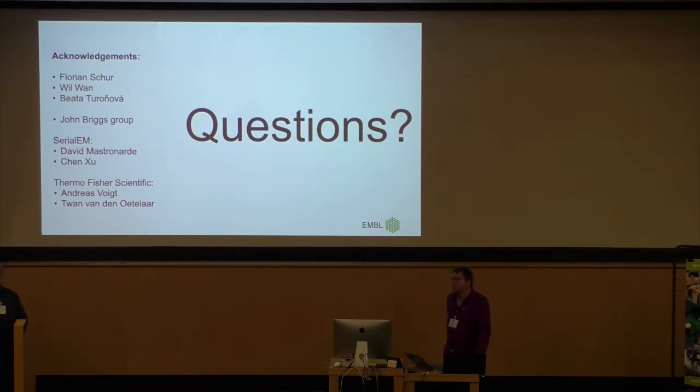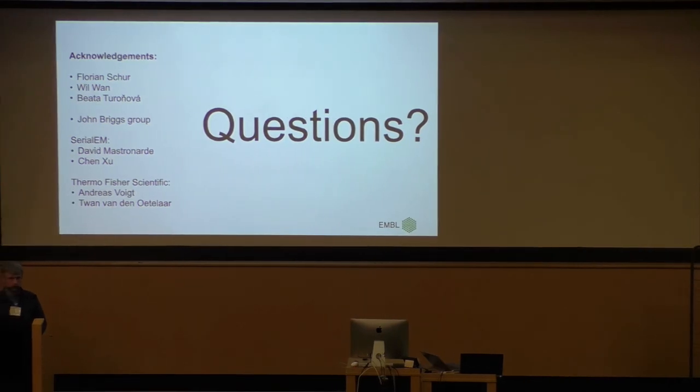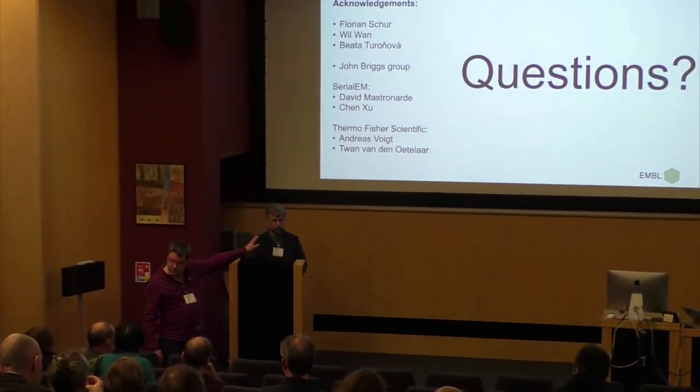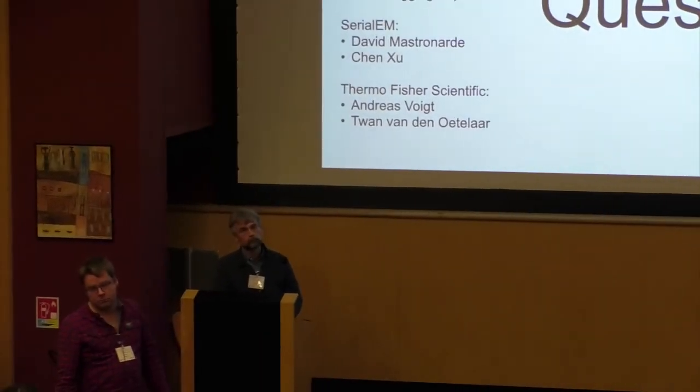Okay, thank you. I still ask you about this small beam. How small can you use for the tomography now? In single particle, our beams are, I'd say, 10% larger than the diagonal of the camera. So it's really just about covering the camera. Depending on location, of course, it's I'd say 400, 500, 600 nanometers. So you don't have this kind of fringe at the top? No, we have had this fringe-free setup for 2-3 years now, but that didn't make the difference. The early results were all without the fringe-free. Then you have to use a slightly bigger beam, yes.